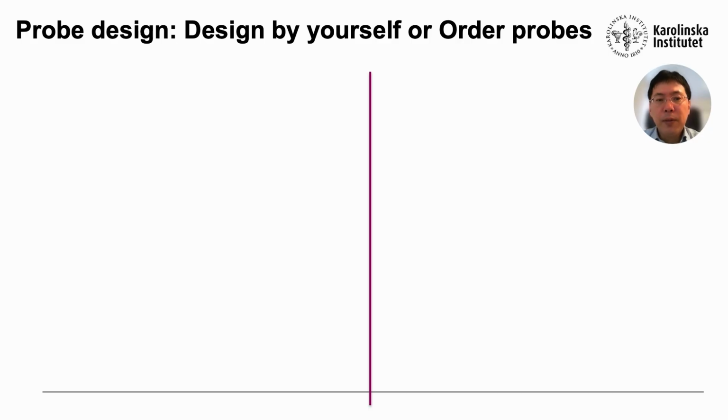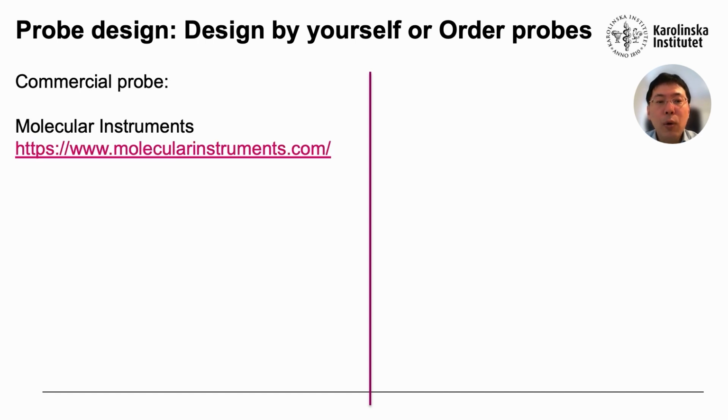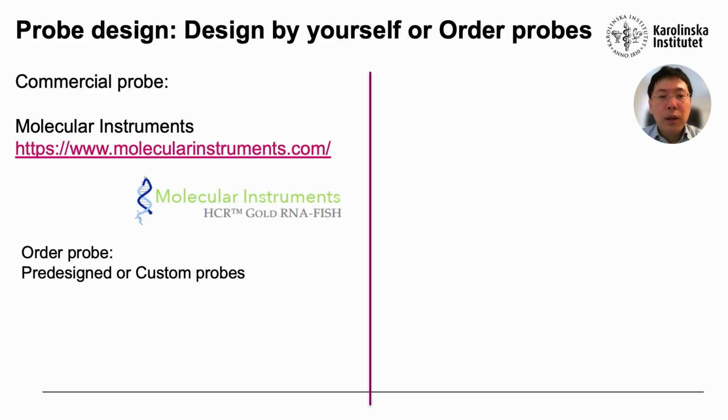Now you've seen the basic design concept. Let me explain how we practically prepare DNA probes. There are 2 main options. One is to order ready-made or custom-designed probes directly from Molecular Instruments. The other is to design the probe yourself.